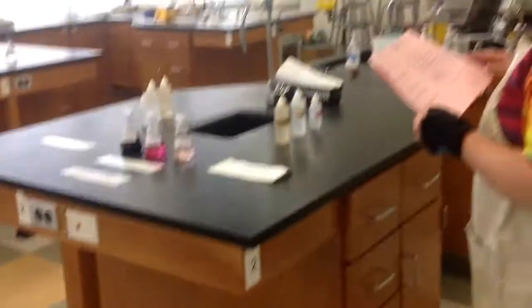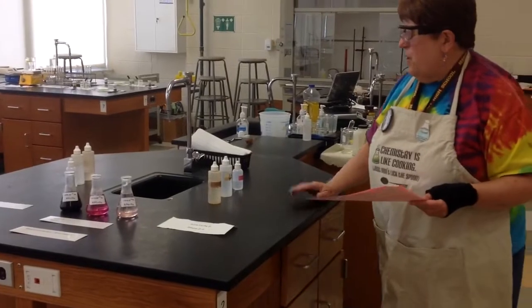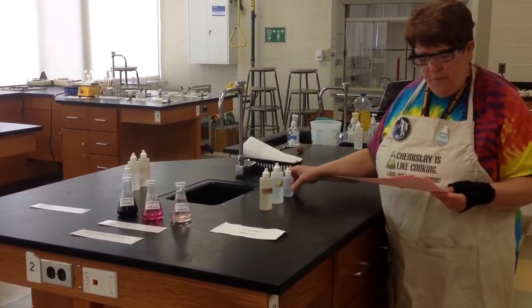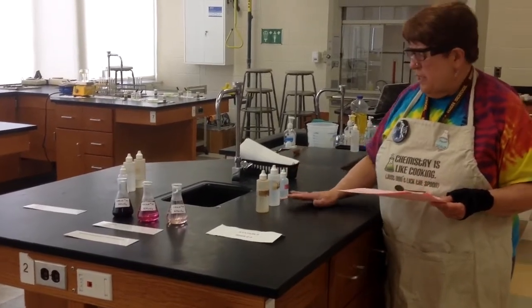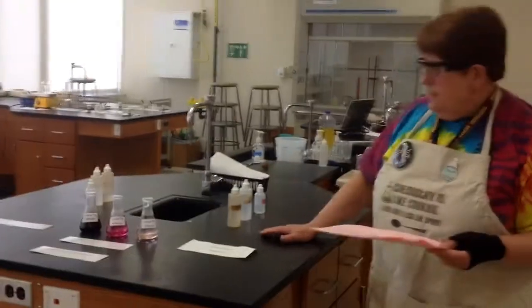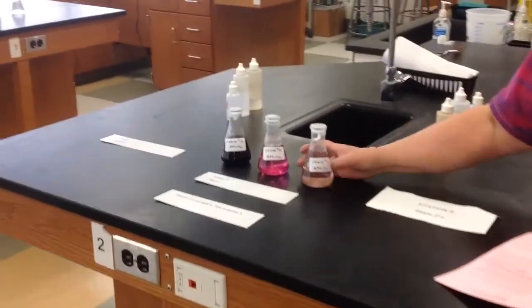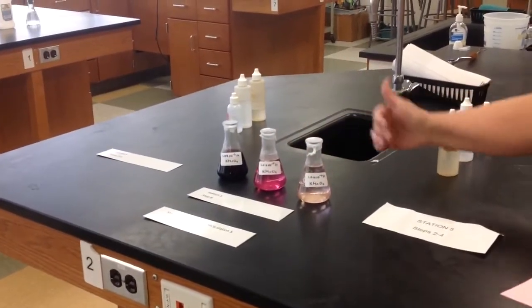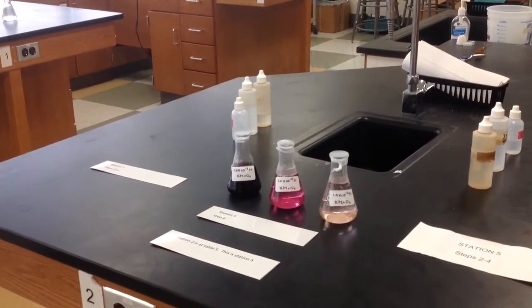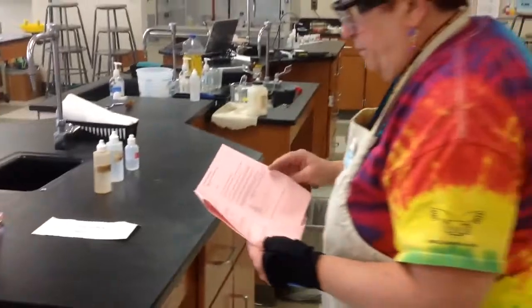And here you're just looking at concentration, which you've been learning a lot about in class lately. On the sides of the table are steps 2 through 4. Just write down what you see on the labels and answer the questions. Step 6 is at the end of the table. You see 3 flasks with different concentrations of potassium permanganate. Just answer question 6 when you look at those.